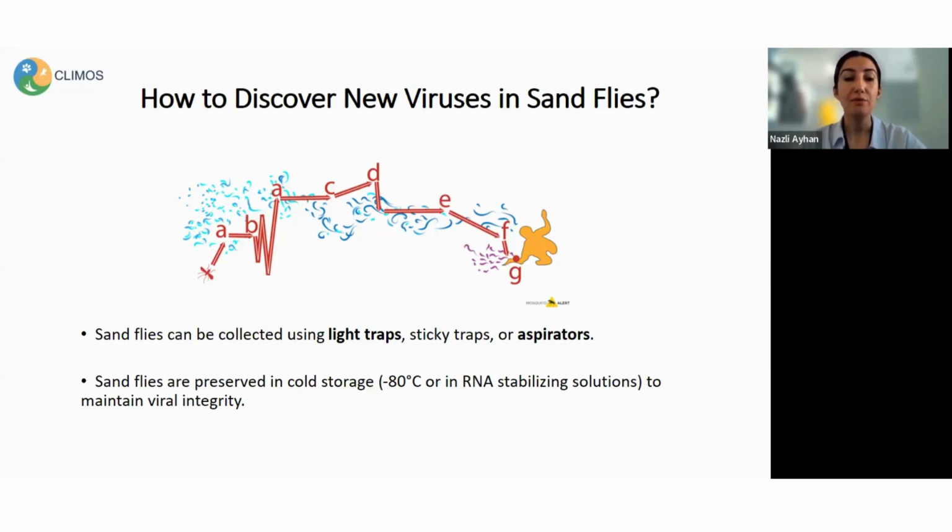Then sandflies are preserved in cold storage: if possible in the field work, in dry ice, and in the lab at -80. Or if our aim is not to isolate the virus, we can also keep the samples in RNA stabilizing solutions to maintain the viral integrity.